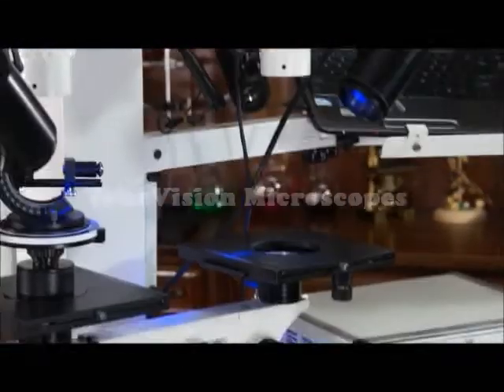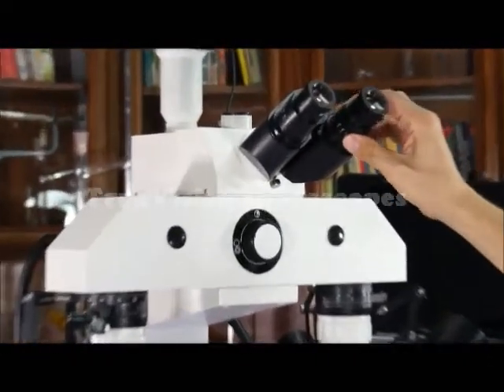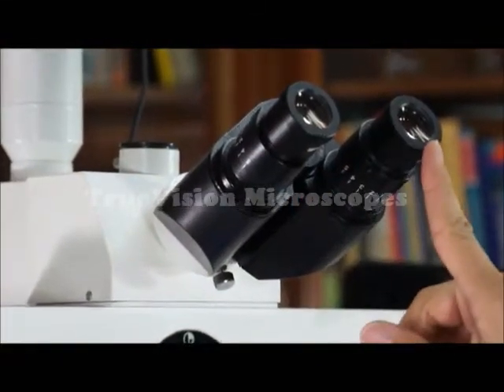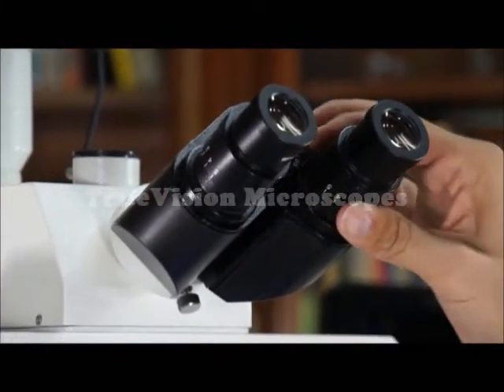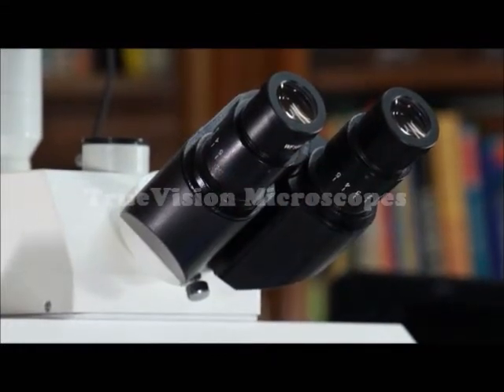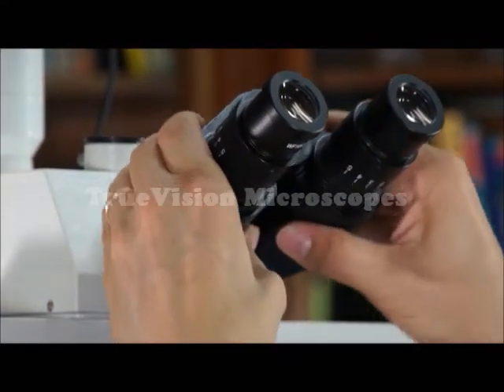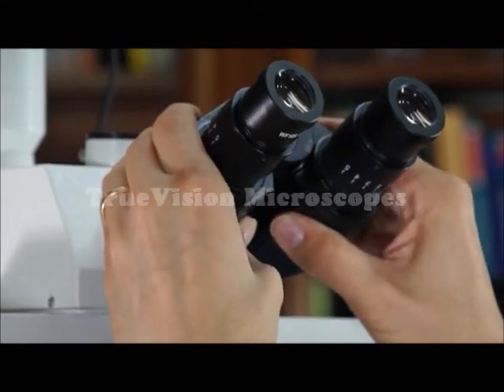The microscope also has diopter adjustments on the eyepieces so that if one eye is in focus and the other eye is not in focus, you use these diopter adjustments to get both eyes in focus at the same time. It also has interpupillary distance adjustment, this adjusts for the distance between your eyes.